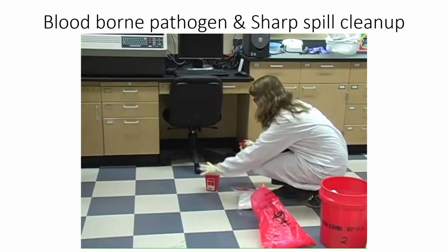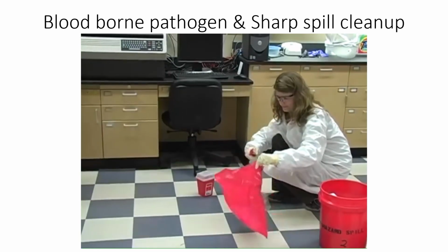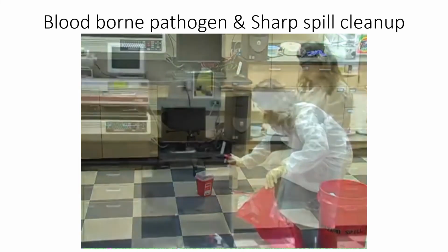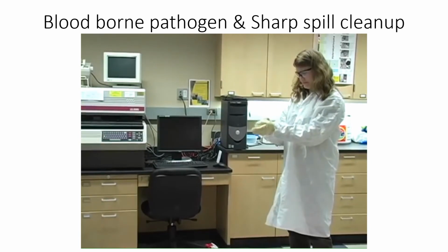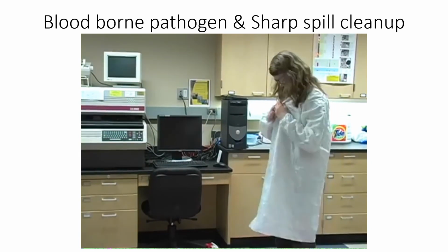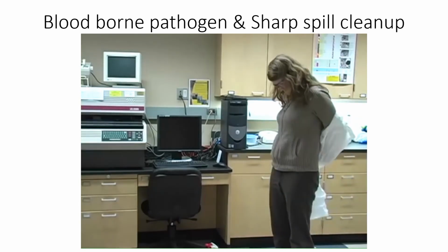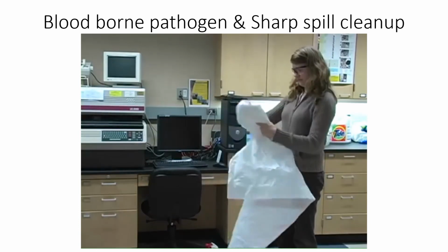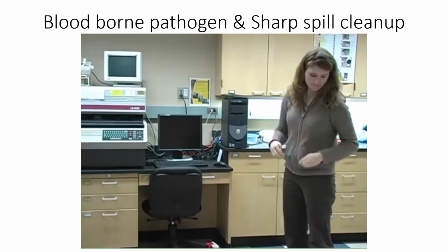After the spill is cleaned up and paper towels and other waste is disposed of, spray the outside of the sharps container, the biohazard bag, and the tongs with disinfectant. Remove PPE, starting with gloves, then the lab coat, and then eye protection. If your hands become contaminated in the process, be sure to wash them before removing another piece of PPE. And lastly, wash your hands one more time after all PPE is removed.